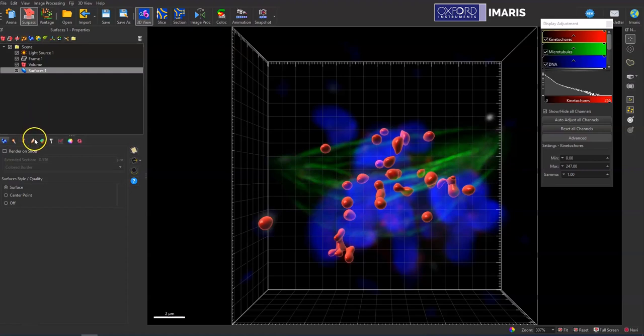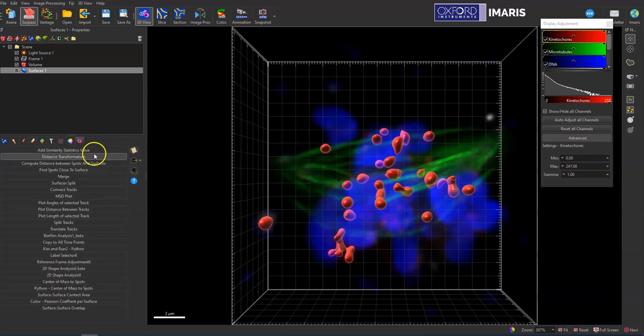Another thing to note is that if you use any mask channels in here, you can't save those creation parameters. They're also not batchable. And if you do any type of extensions, those are also not savable as creation parameters or in batch. Let me know if you have any questions.